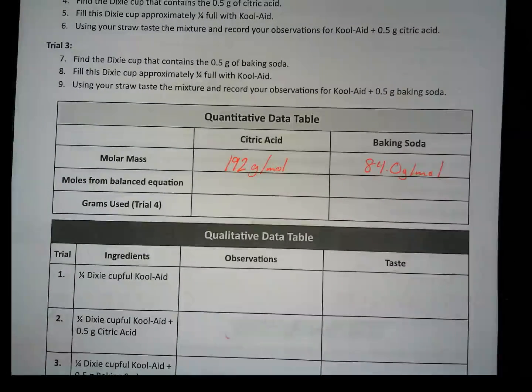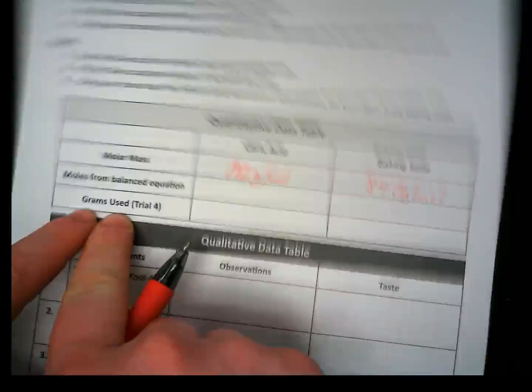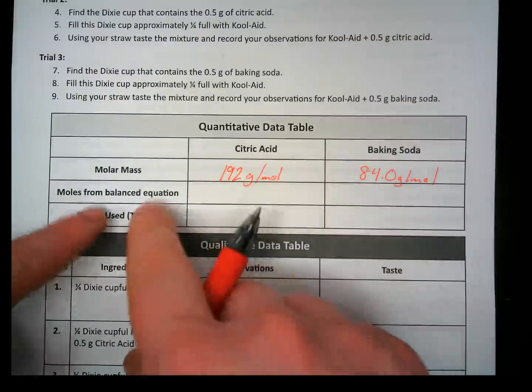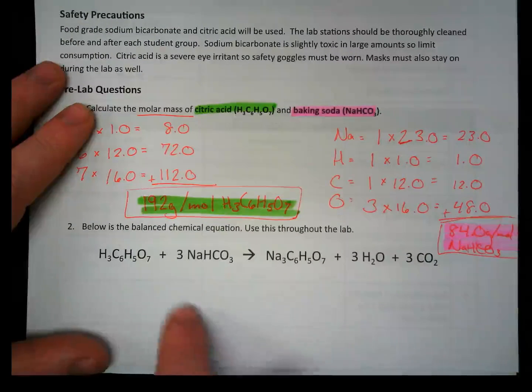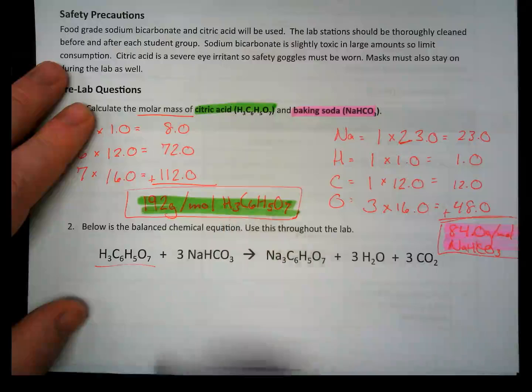Okay. And while we're here, let's now fill out the rest of this quantitative data table because we've got everything that we need for these two. We don't have this yet. That's going to be something that will be later on in part 3. But moles of the balanced equation here, we're going to look at the balanced equation. And it's just asking for the molar mass. Okay, or sorry, the molar ratio. So here is our citric acid.